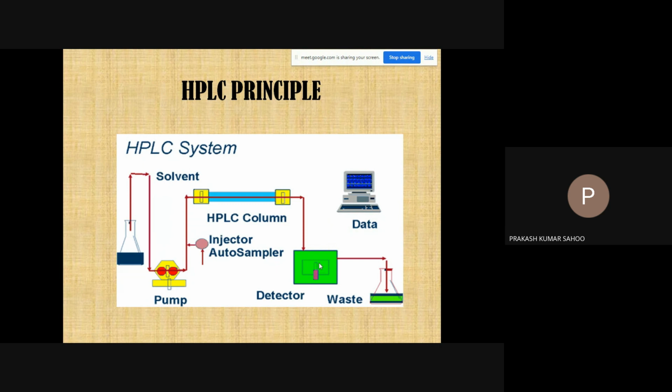And then after the detector's detection, it will be recorded at the recorder part, that is mostly the computer.